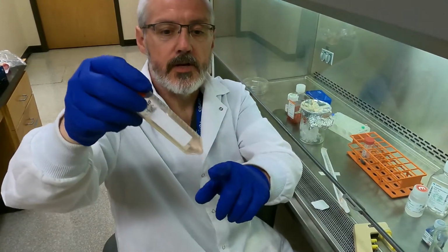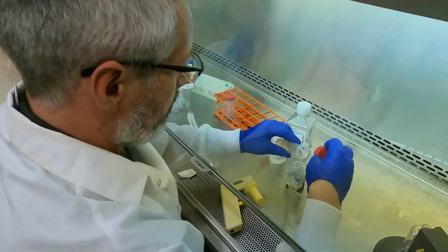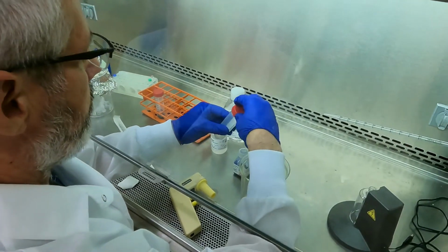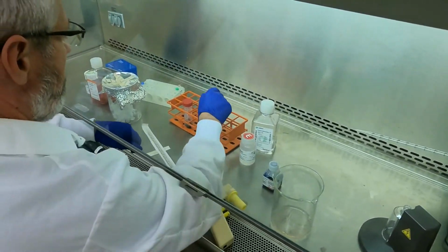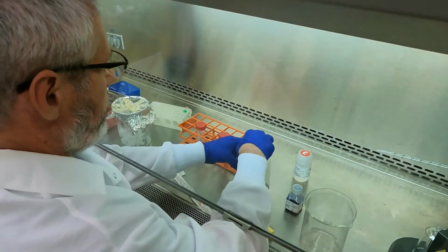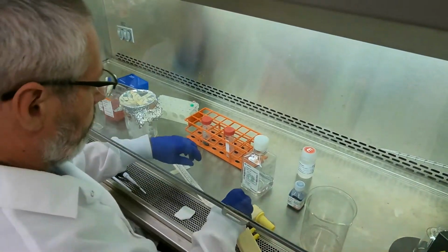Okay, so there's a nice pellet there. Okay, so I'm just going to tip, be very gentle here, and just tip. And then you've got your pellet, and then you just break it up like that, very gentle. I want to be as gentle as possible here. And then I'm going to take this up in 10 mils, so it should be about 1,000,000 a mil, hopefully.